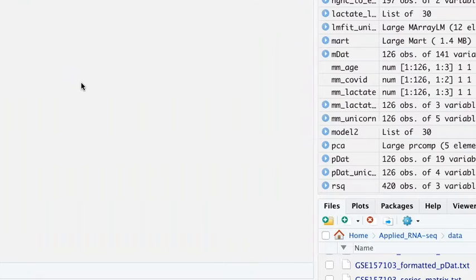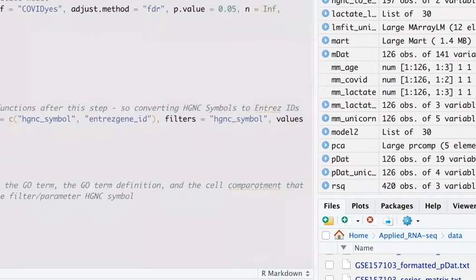It will take a lot of time to run, but when you have that, it's just so much easier to go into it as a text file and then just write join, or just pull out the ones that you want, instead of doing the biomaRt getBM function over and over again. Okay, so we got that.